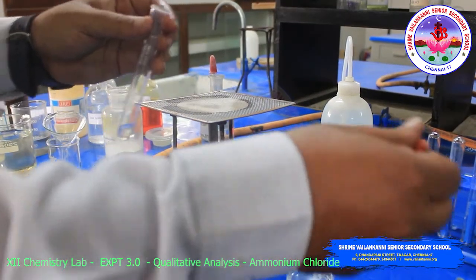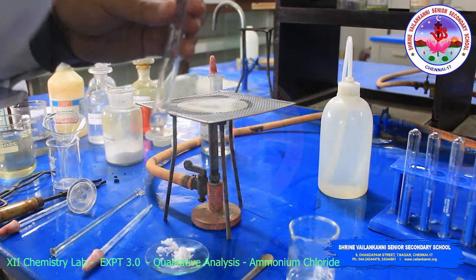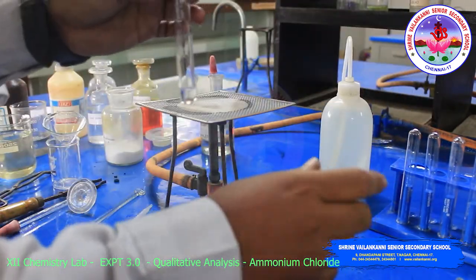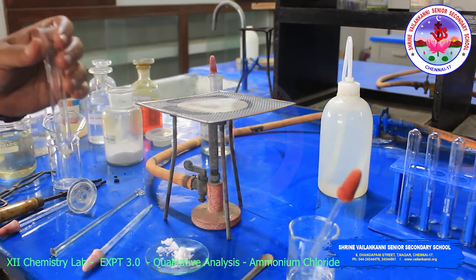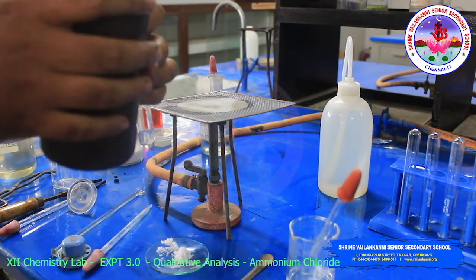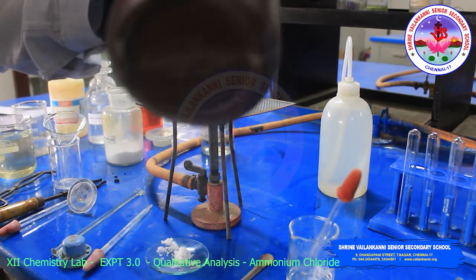Now take this cooled solution, that is the extract, then add silver nitrate. On adding silver nitrate, it shows the curdy white precipitate.